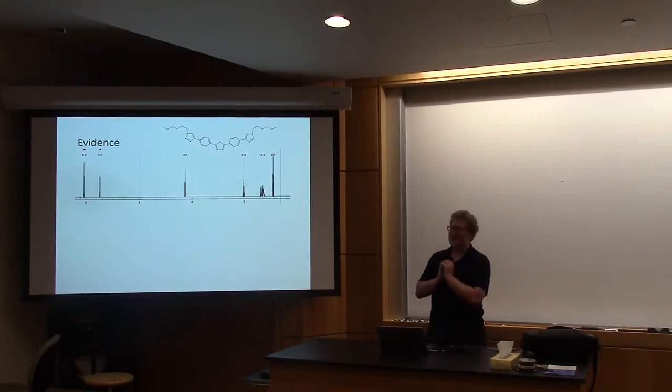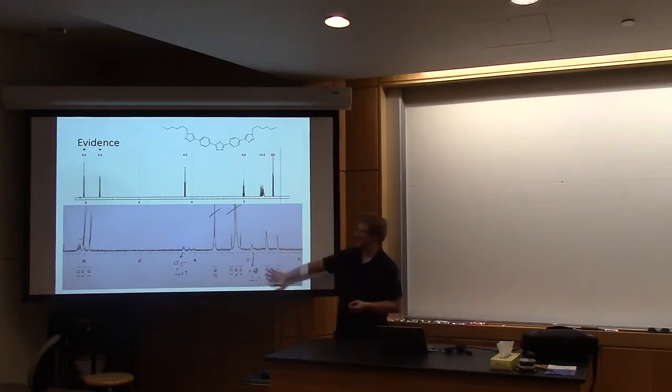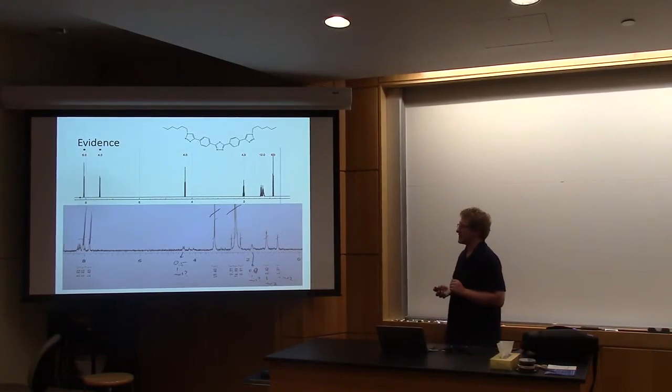That isn't quite what I got, though. What I got was something more like this. Just so you're aware, you can ignore these two larger peaks right there. Those are solvents that got in, interfering with the signal a little bit. If you step back and look at this, you can see that it's almost close. Like over here, we've got these two peaks, and they're pretty close to where they should be.